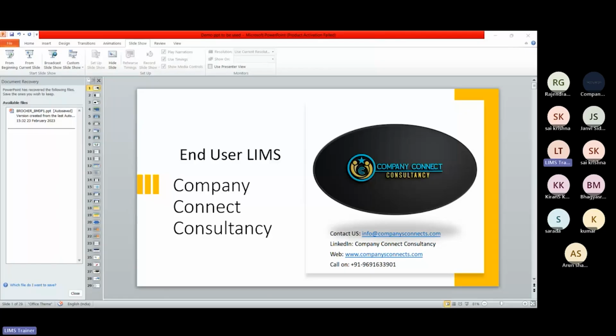Now, another thing, this data that is acquired from the system is stored, and it can be tracked on time. If you want some data of previous years, 100 batches, it is possible with this software. If you want to compare the data of the previous studies, this is also possible with the particular software. Then we can say we can improve the efficiency of the analysis. So these are the benefits that we are getting from laboratory information management, and that's why this is important.